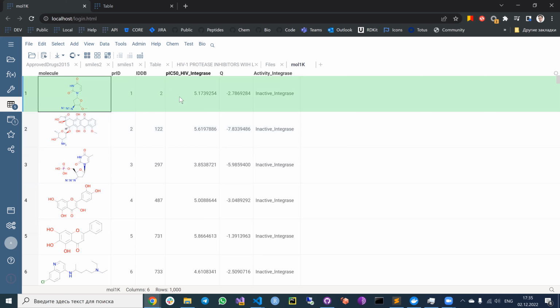Just for now, it is checked that all the structures contain equal fields, but we're going to enhance it to analyze if there are spaces, or if some of the entries do not contain a specific field.